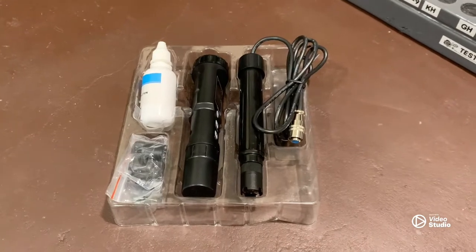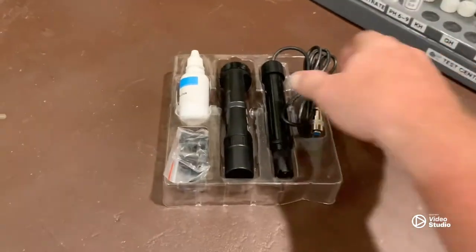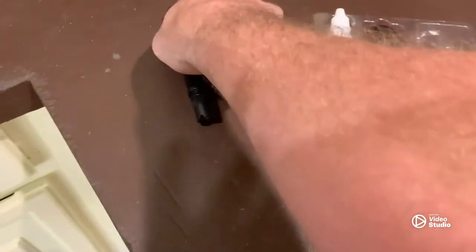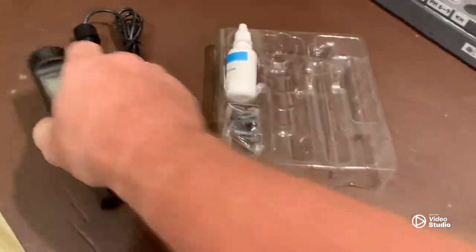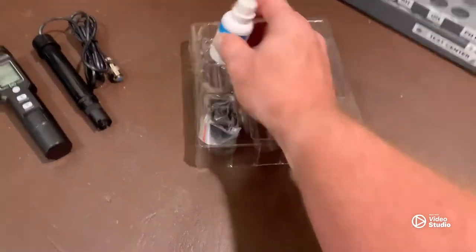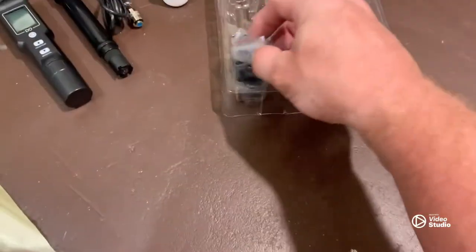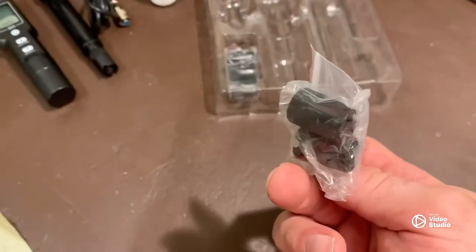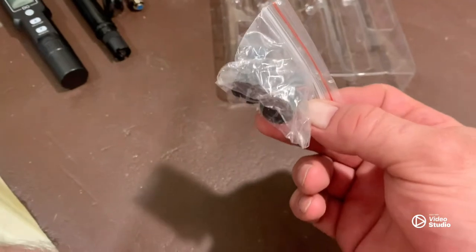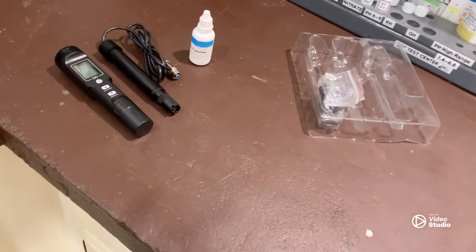All right gang, so when you get this you are going to have your probe, your monitor part, some electrolyte solution, and then six of these membrane caps.